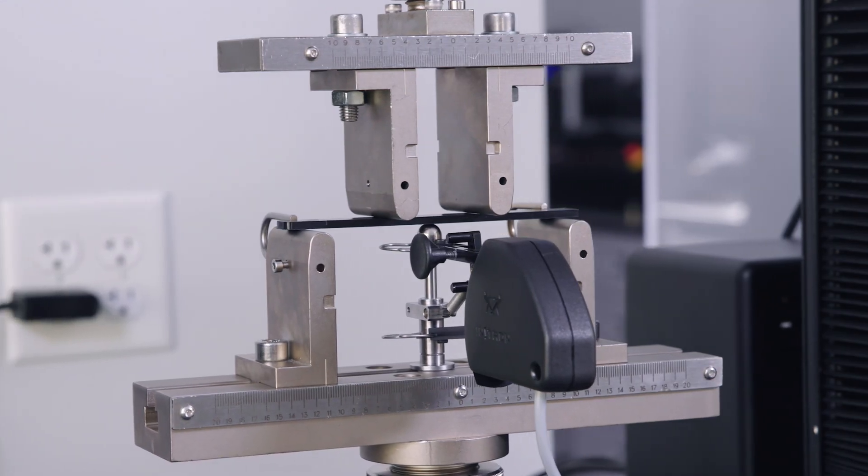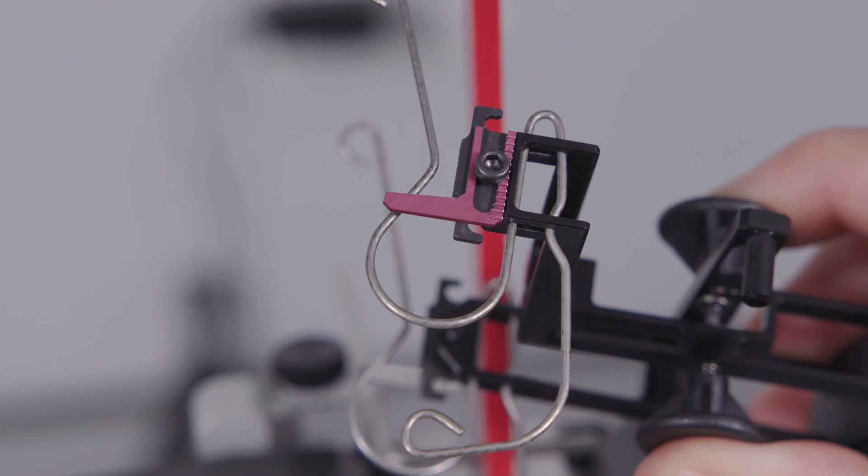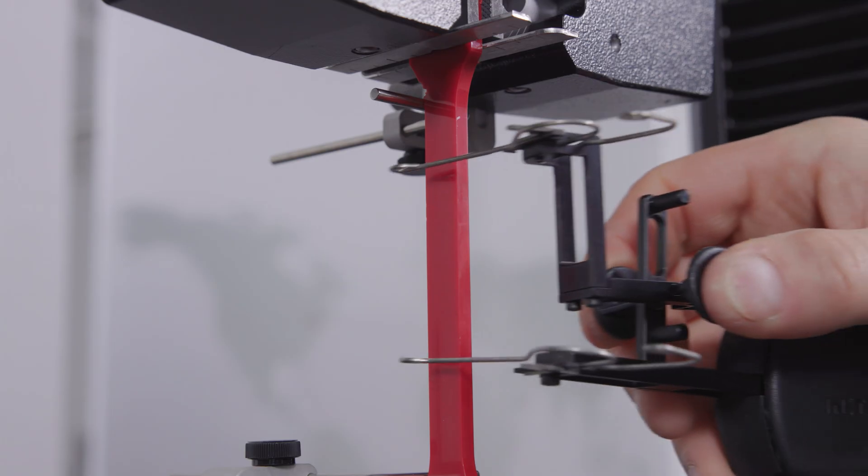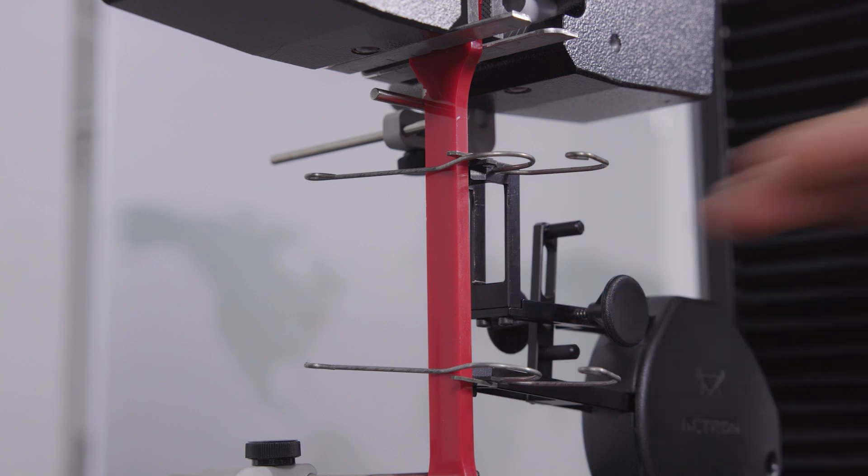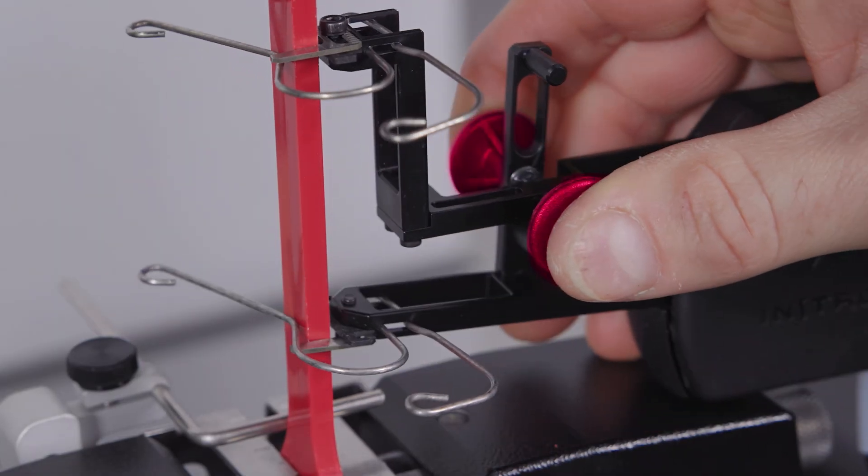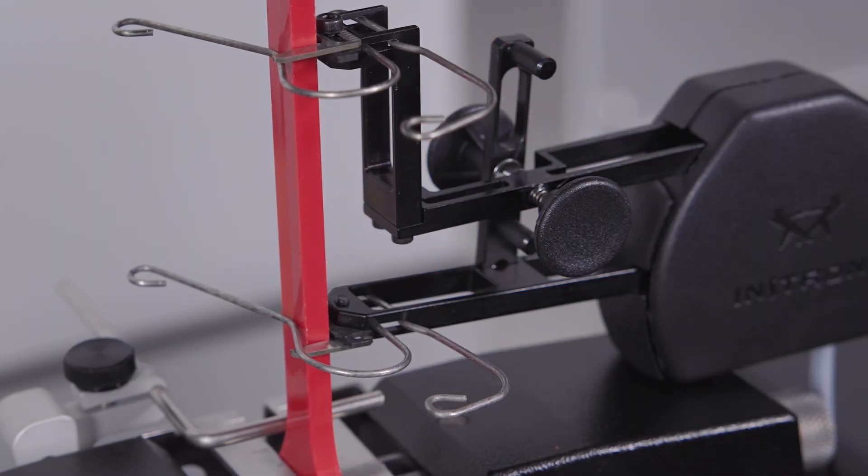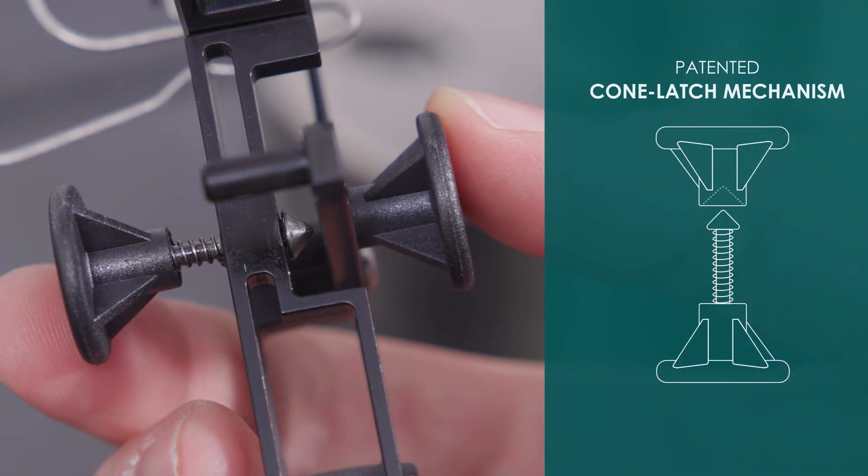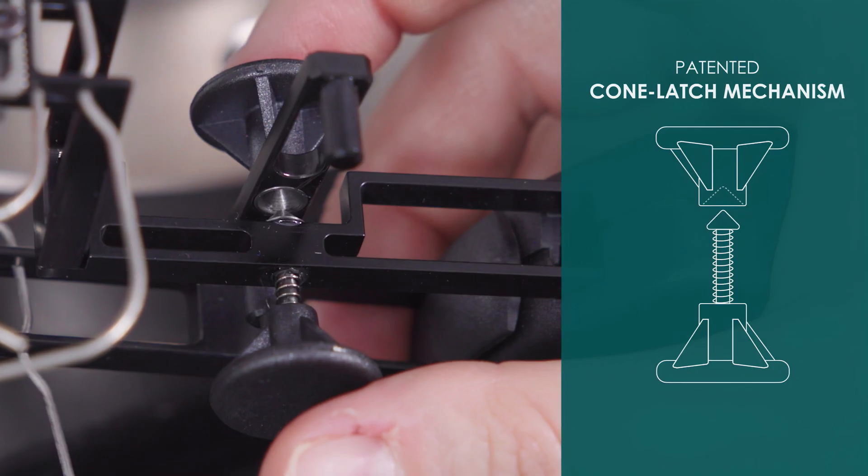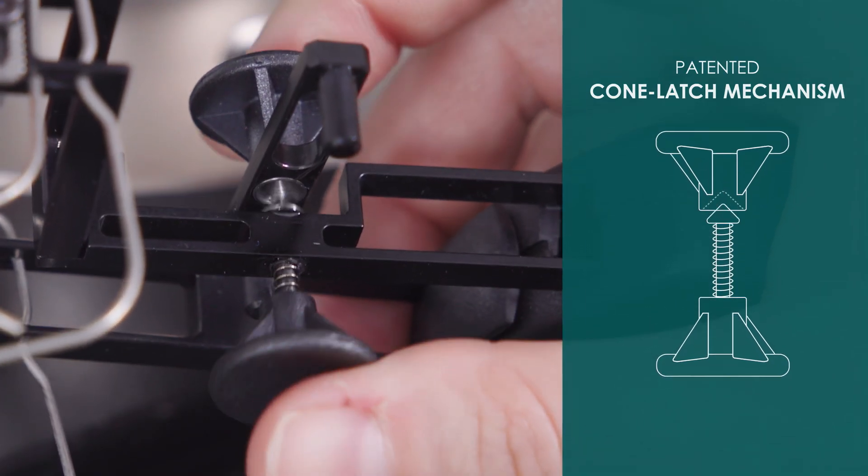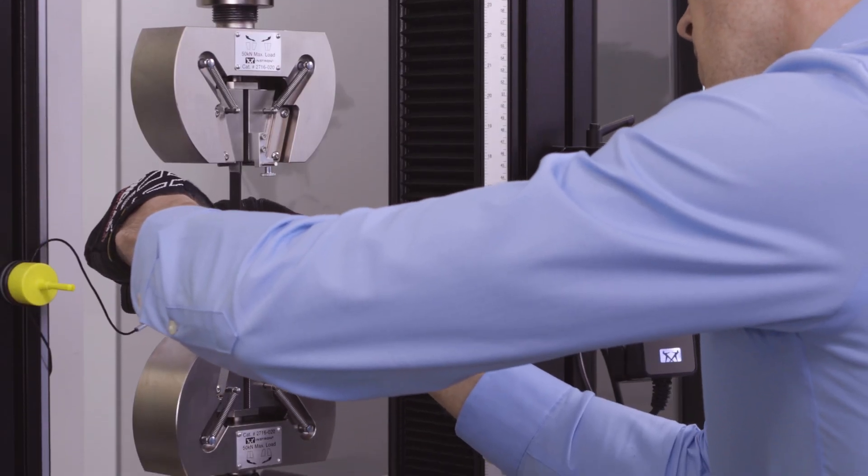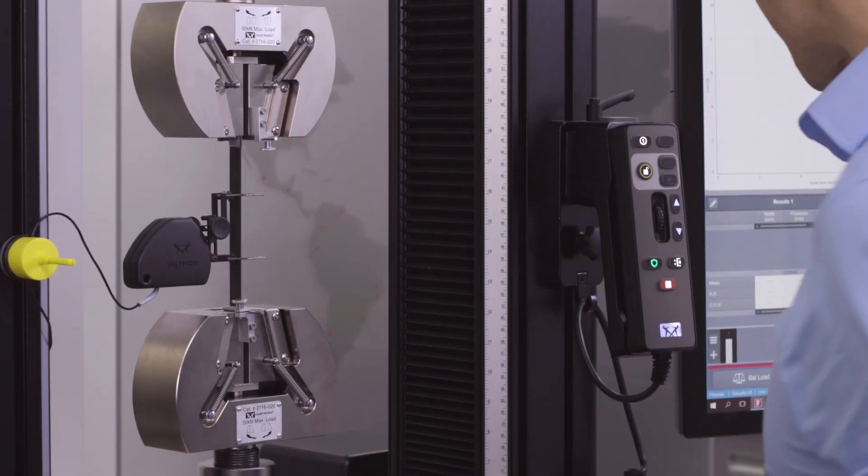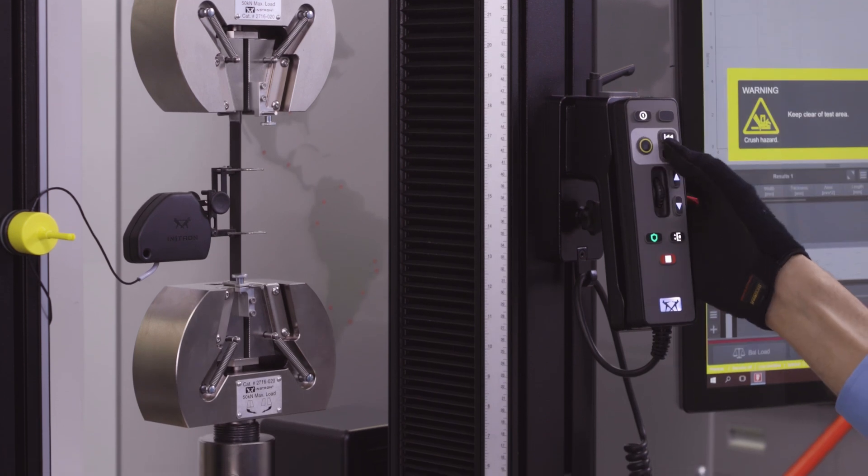The Clip-on Axial Strain Gauge Extensometer also features centering guides that make it easy to attach your specimen accurately and consistently, and a gauge length locking device that automatically releases itself after attachment. A patented cone latch mechanism eliminates the need to remove any pins or clips prior to starting a test, ensuring you never accidentally start a test with the extensometer locked at gauge length.